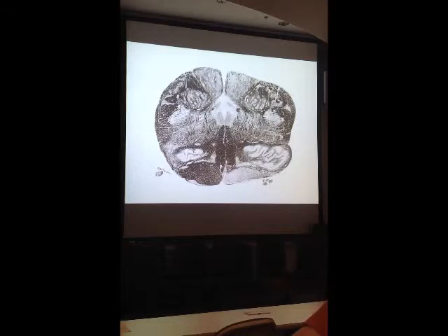Now, this cartoon is in here, slide 9. This is slide 9 because this is the level where the fibers that make up this medial lemniscus originate. They originate from these nuclei back here. These are secondary neurons of the dorsal column system. The neurons that make up this nucleus closest to midline is what nucleus?